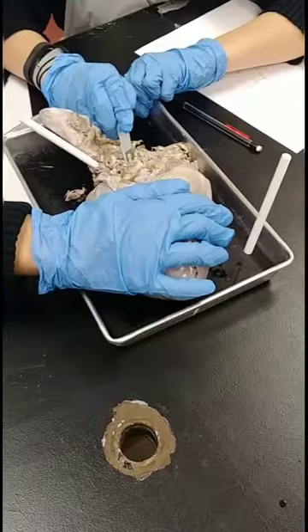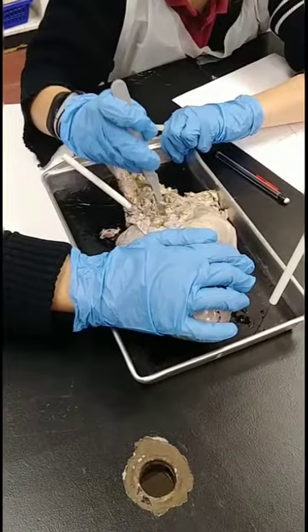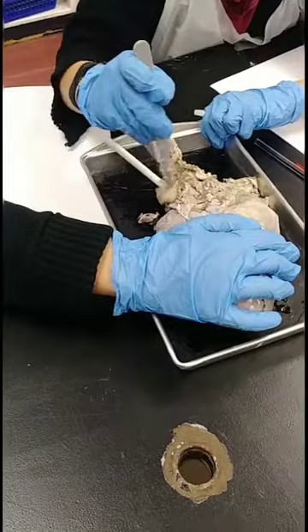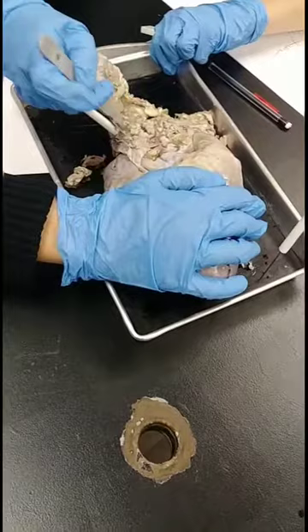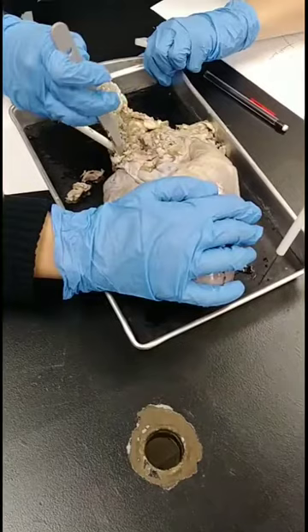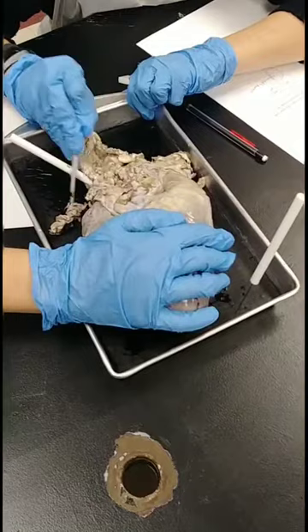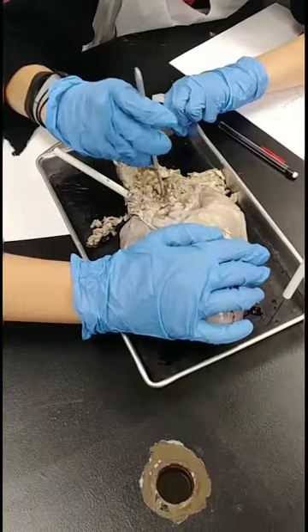Okay. Here we go. Veins are much thinner than the arteries. This whole thing is a pulmonary trunk. So get your scaffold first. Make sense? Then we'll be able to locate the... and yours is a little more attached than theirs is. You see this? See how thin it is? See, this is very thin, one of the veins. Put a probe there. The aorta is much thicker.